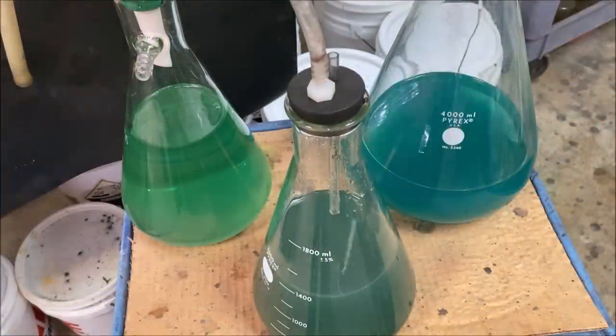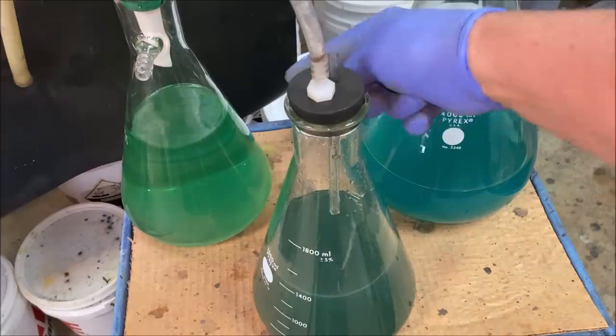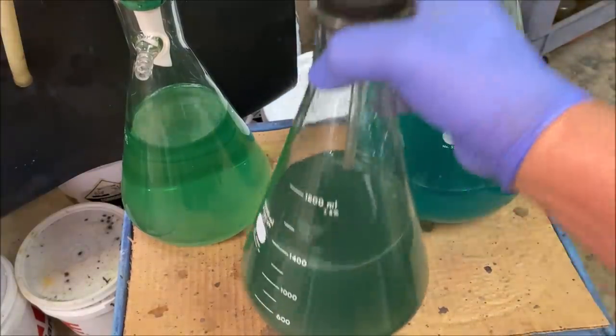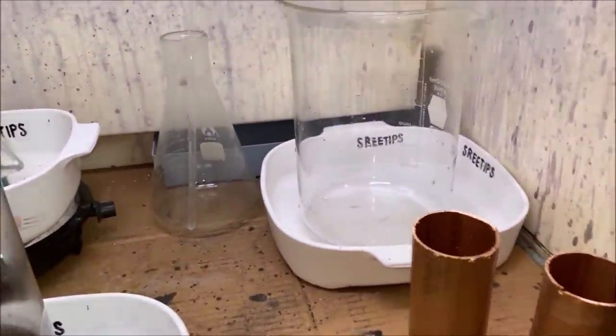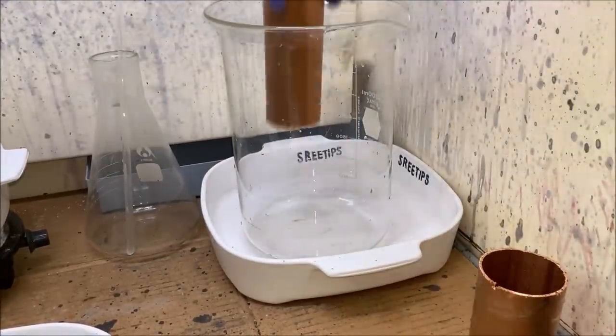These are our three solutions that we've collected from this process. This was the solution that we tried to filter in part one. This was the stuff that we pulled off from the solids in this video. And this is the one that we just vacuumed off. So what I'm going to do now is I've got a clean beaker back here. I'm going to add some pieces of copper to this.